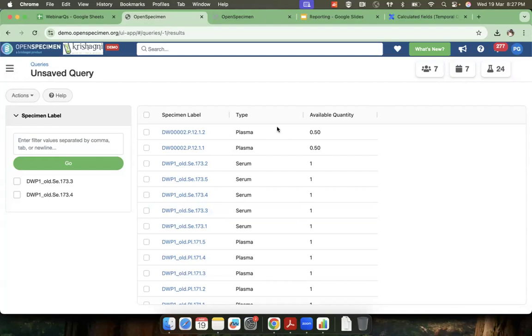So the only way we can think of is that you can use the aggregate function max ID on the event ID or the visit ID. That would bring back the latest visit, but there is no function to get the latest event as such. So I imagine your question is, if a participant has 10 visits and you want to find the latest visit.